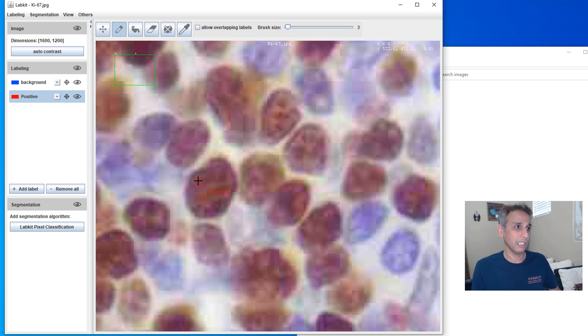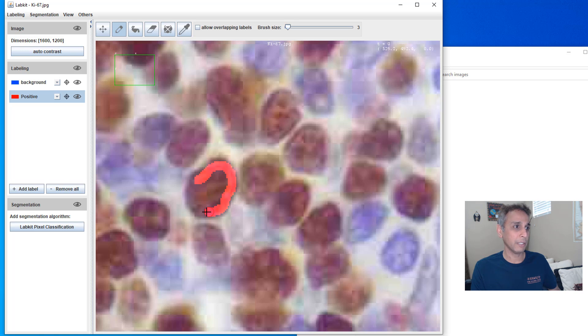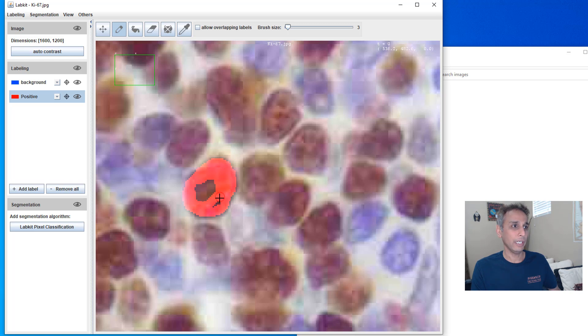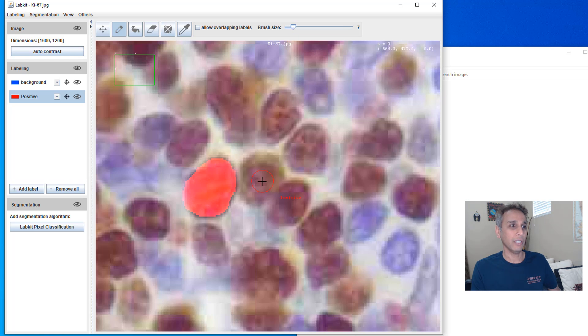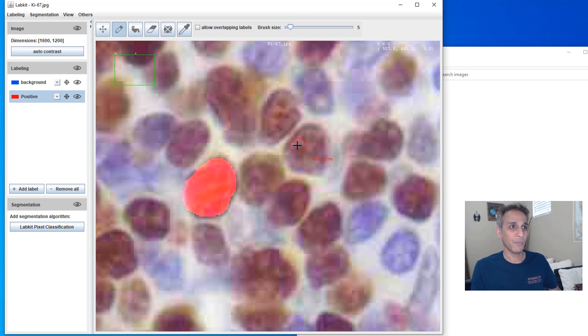So let's go ahead and start by annotating a few of these. Let me zoom in and this is the pen draw button right there and let's leave the brush size to, I don't know, three right there and go ahead and paint the pixels.